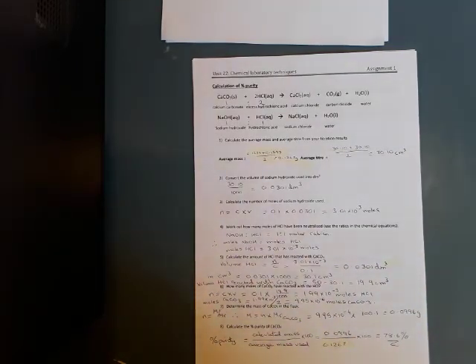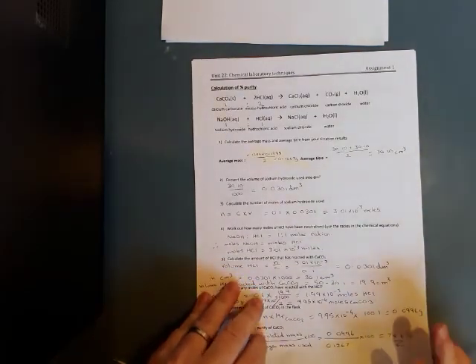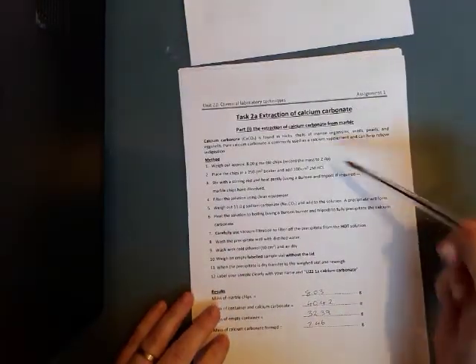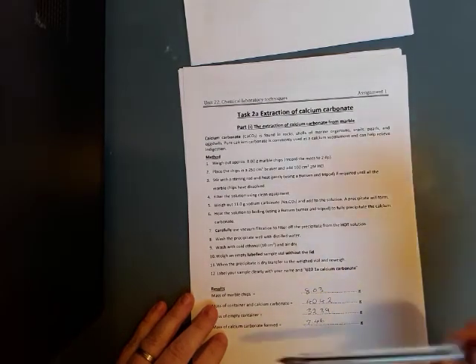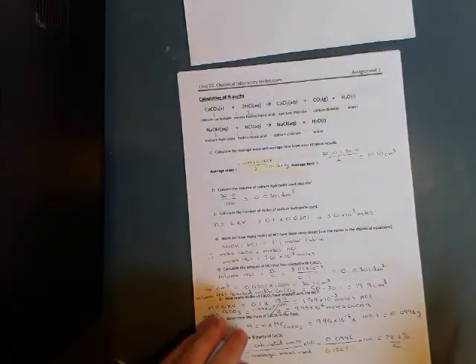These back titrations do take a lot to think about, because instead of a normal titration, where we've got a straightforward calculation, we have two distinct parts to the calculation that we have to do. So again, we've worked out a purity. It's not 100% pure. So obviously there's 21.4% within that sample that we tested that potentially isn't calcium carbonate. So again, we can have a think about that. Where do we think we could have got impurities? And of course, with that, relating it back to this methodology. So think about what I started in the video talking about the methodology and issues there, and relate that back to the percentage purity that we've just calculated.